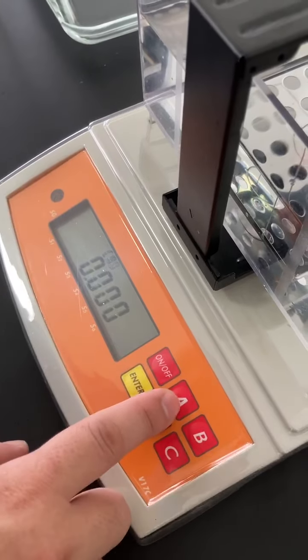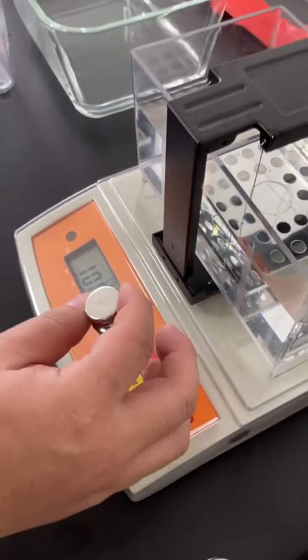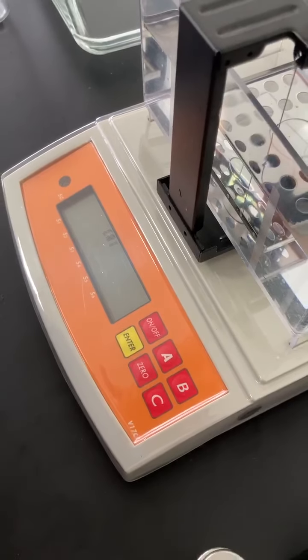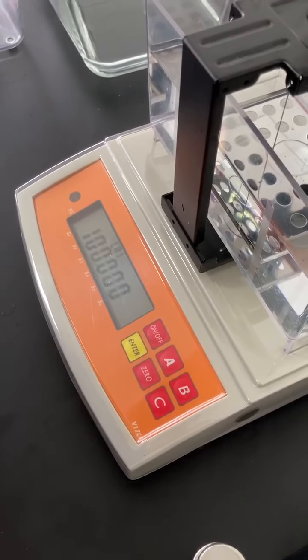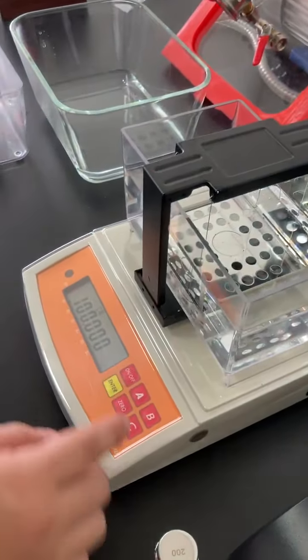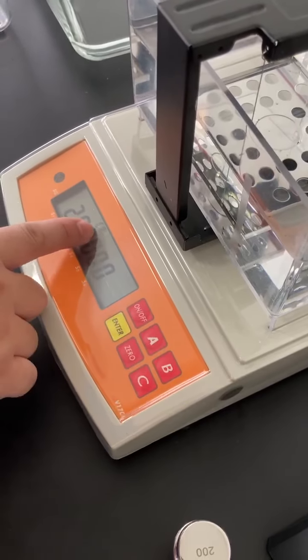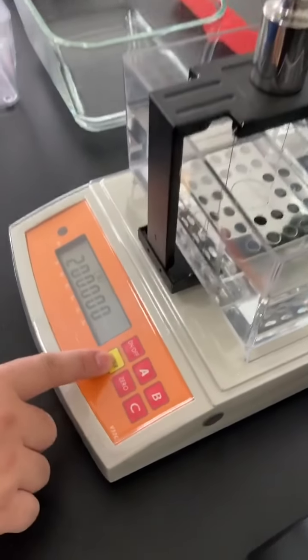Press button A to CA1, put the 100g weight here and press enter. Then press button A to CA2, put the 200g weight here and press enter.